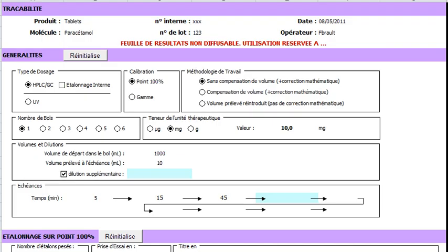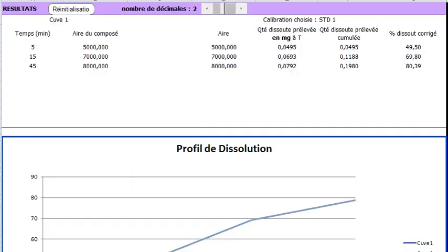Now we switch from the full correction to the intermediate one, like this. Of course, the results are different.